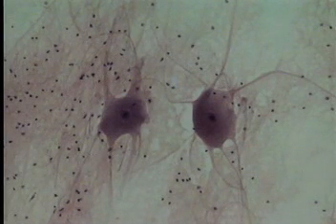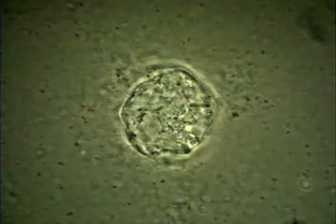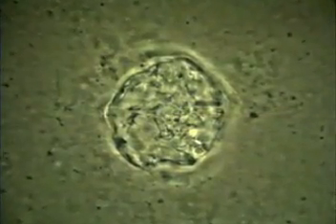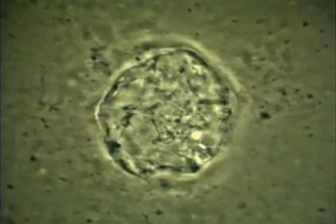In our work, we use phase contrast microscopy to look at other facets of the nucleus as it's going through different cell cycle phases. We've already used a fluorescence dye to identify and visualize the DNA in the nucleus. We use phase contrast microscopy to visualize the nuclear envelope, which is an envelope, a membrane that surrounds and contains the DNA, which is a very specific structure which only occurs during a certain stage of the cell cycle, and it's very important for structure to be formed properly in order for normal cell division to occur.